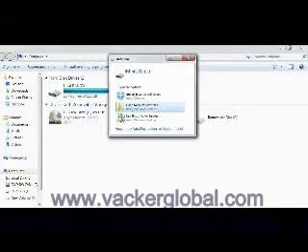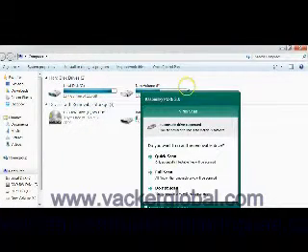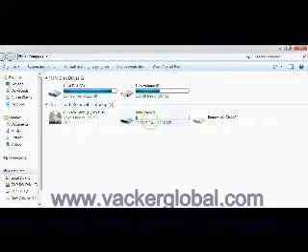There is no special software or drivers required. You can see that the USB appears on the screen and you can open reports in different formats.